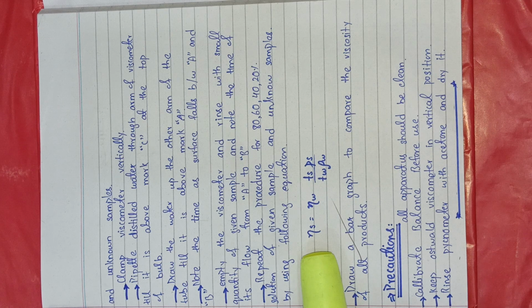So now you are going to clamp your viscometer vertically, and pipette distilled water through the arm of the viscometer till above the mark C at the top of the bulb. So by pipette you will add distilled water into the viscometer through the arm, and you will fill the viscometer up to the mark C, which is labeled on the viscometer.